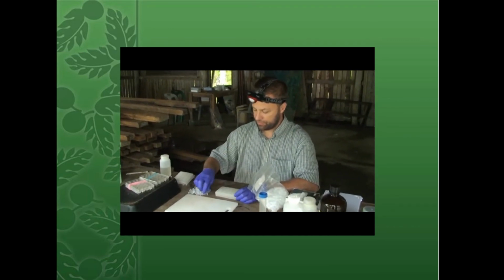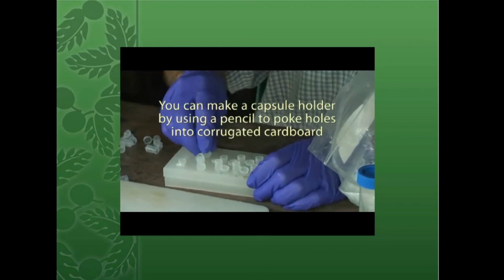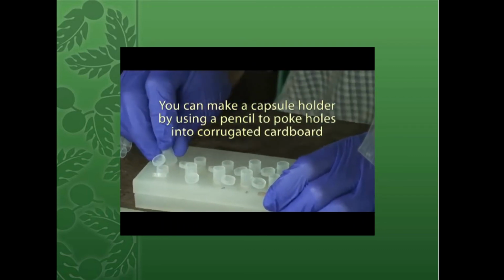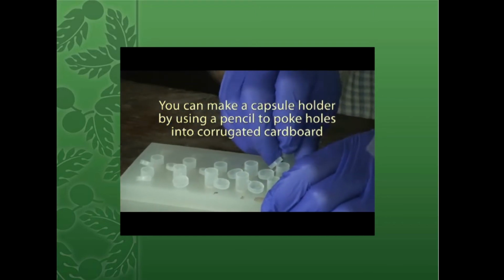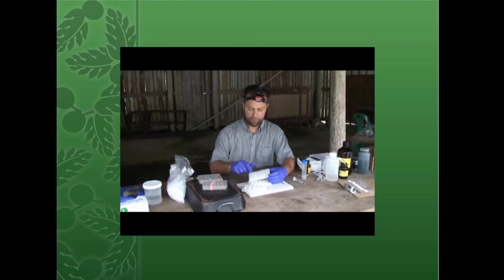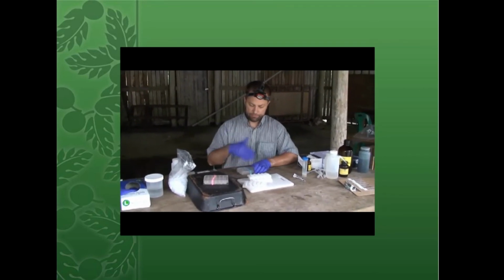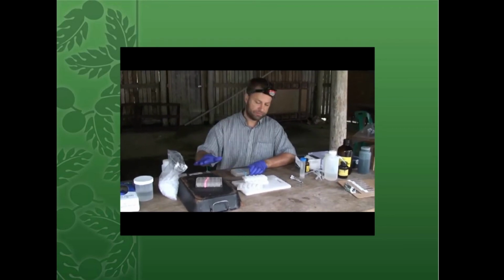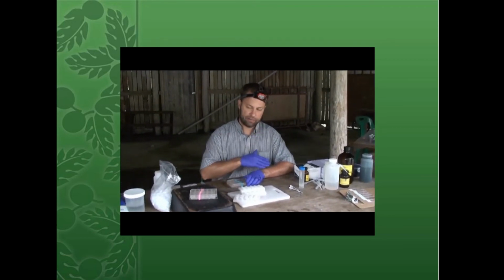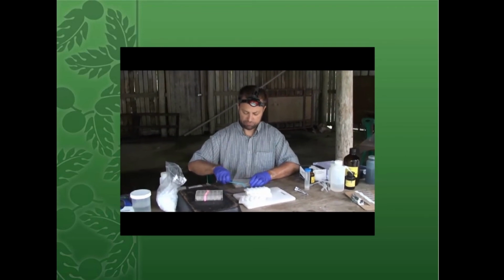So we load up our tray with 15 beam capsules. Alright, now that we've got our JB4 trays loaded up with the beam capsules, we're going to go ahead and load our specimens into there. It's easiest to load all the specimens first before you catalyze the resin and put it in there, because the resin is really only good for about 5-10 minutes or so.